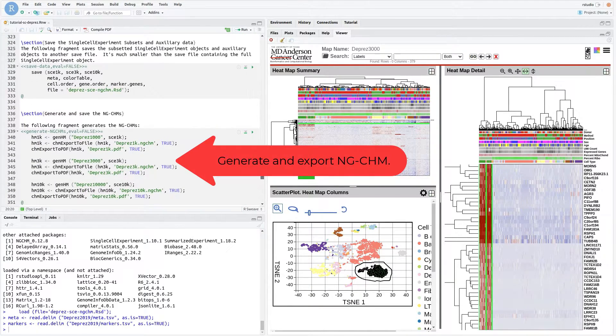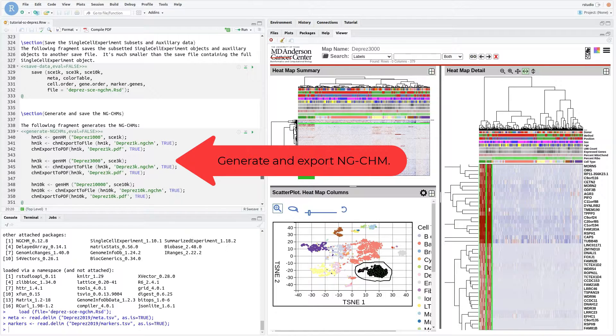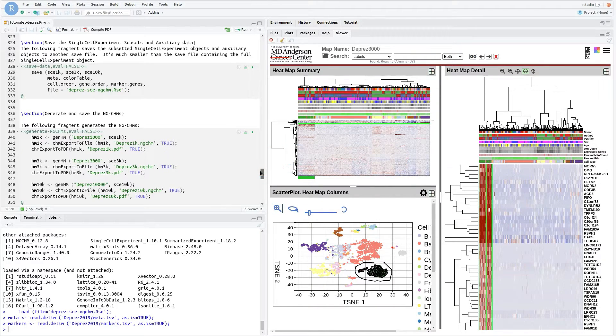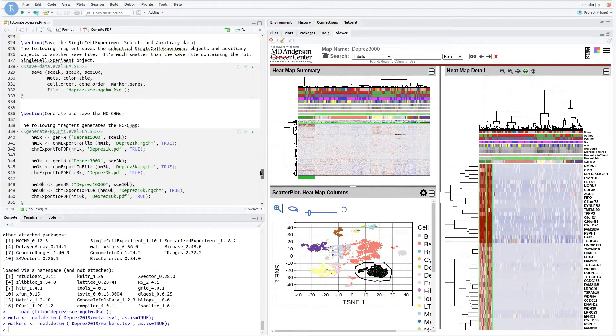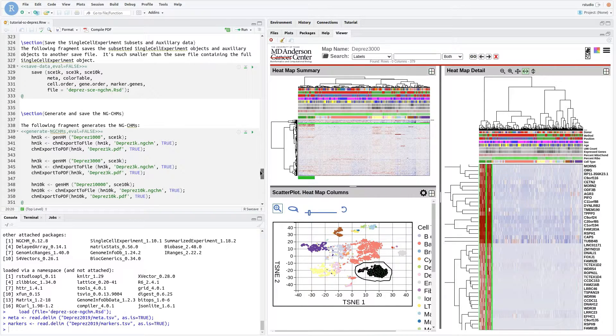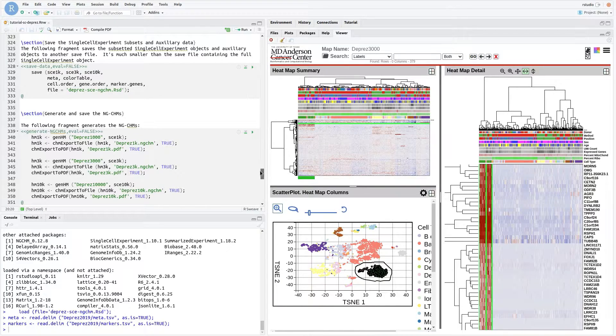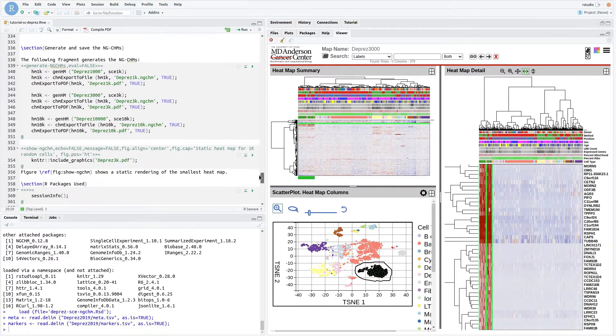Finally, we can generate the NGCHMs and export them for viewing. We can also output a summary PDF of the NGCHM. The first page of the NGCHM PDF is also included in the PDF created by this script.